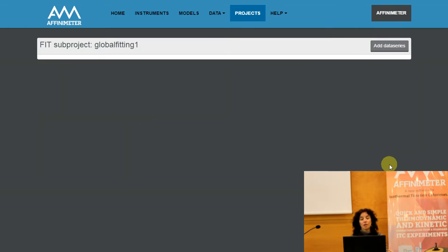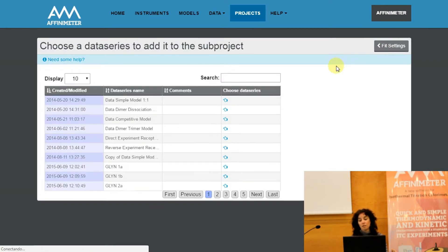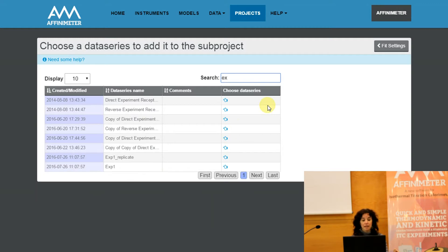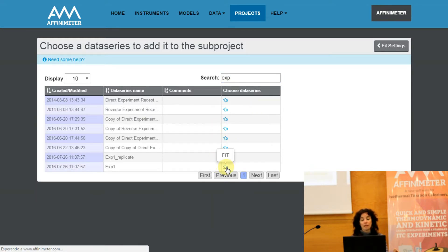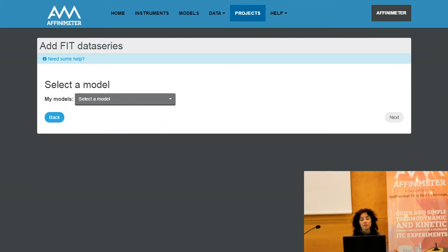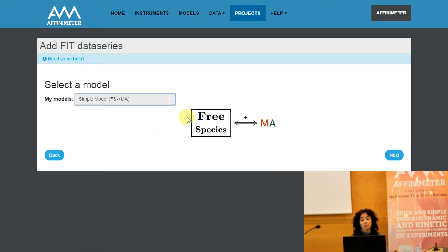Now we have to start including the data series or the isotherms that we need to fit. Click on Add Data Series — this option will take us directly to our database of isotherms. Select the first isotherm you want to analyze. At this point you can visualize your isotherm and delete points at this stage too. Click on Next and select a binding model. In this example we are going to select the simple binding model that goes from free species to the formation of the complex MA.